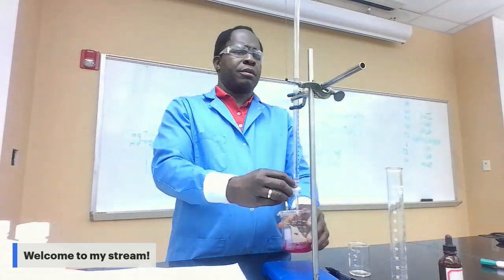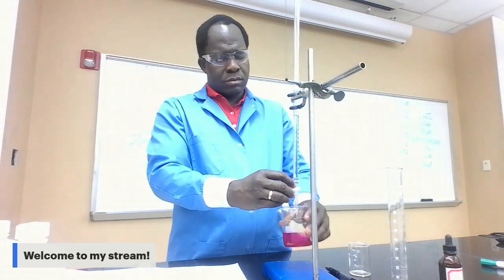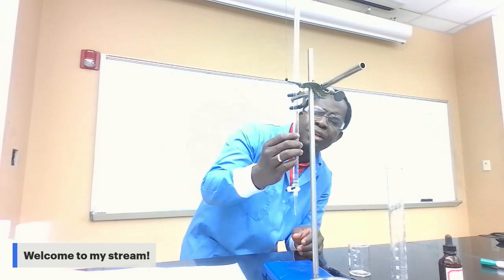I'm gonna continue to the third one. Okay, so I get to equivalence. The solution also becomes clear. So I moved from 27.5, I get to 41.